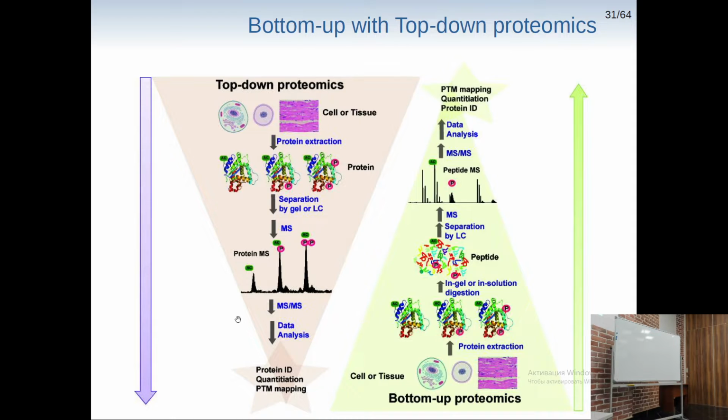But actually it seems that nowadays some interesting ideas and also some additions to proteomics move us from bottom-up proteomics, which is 95% of all works, to this kind of work, which is more laborious, which requires more time, money, whatever, but allows us to get quantitative information on post-translational modifications with ease.